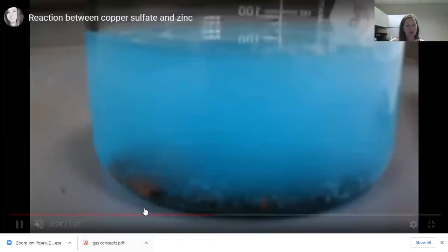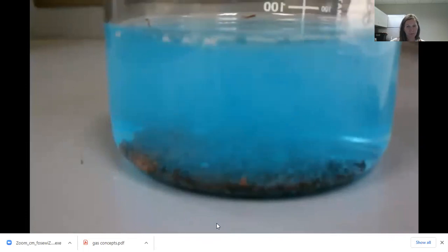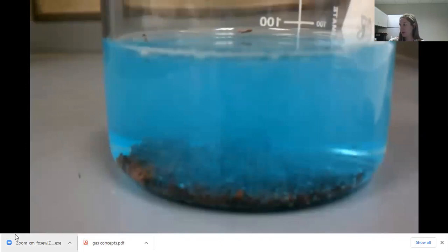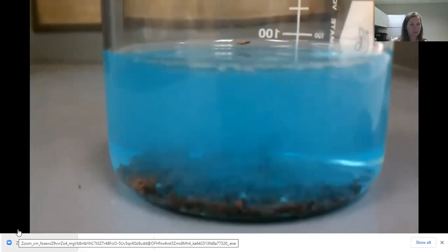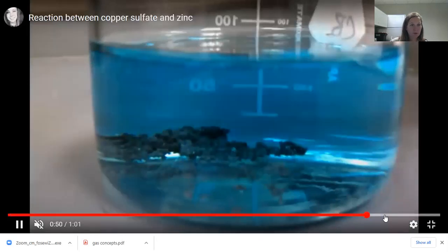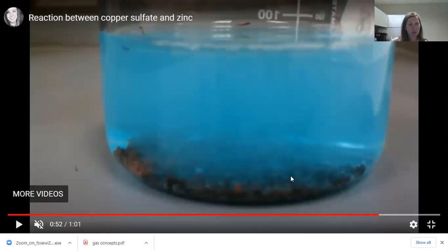But then towards the end, you'll notice you can start seeing already that some of the grayish black solid, pieces of it are turning a coppery color. If they let it continue until the reaction is complete, you'll see all of that solid is going to be a coppery color, no more of the blackish gray solid anymore. Sorry, it kind of stopped, so I'll pause it here. So what we have now is the solid on the bottom is now copper in color, and the solution itself is zinc sulfate. That's what's in solution, zinc sulfate ions.